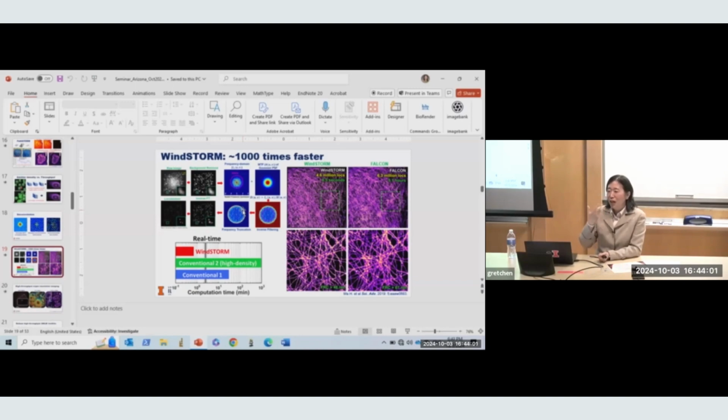If the exposure time is too short, you end up with lower resolution, because in single molecule localization, the photon counts essentially determine your resolution. But people have done it, especially for 3D, and spinning disk confocal is actually an ideal case because they remove all the background with the sectioning.